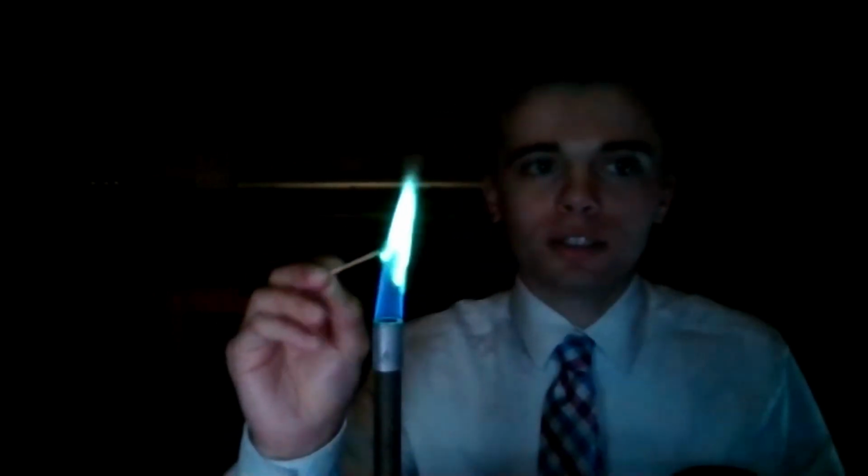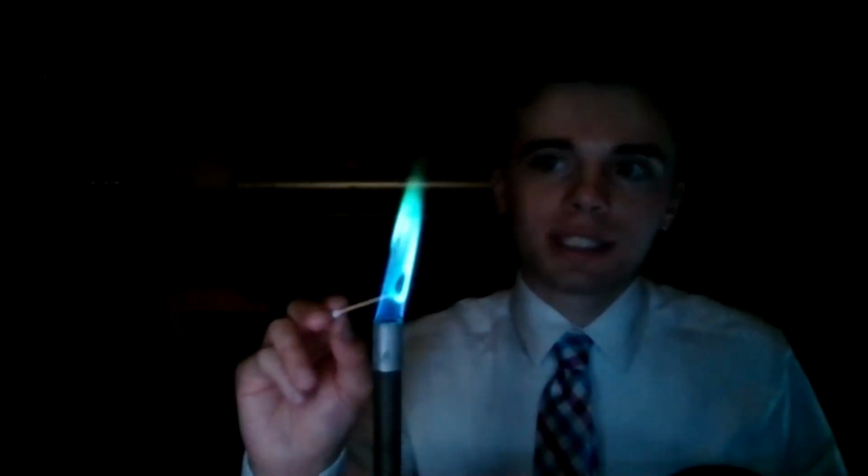No, isn't that cool? Copper's green. Luke, we'll do lithium next. Look at that, though. Normally, you would get to do this in person. You'd all be in groups and you get to do this. Maybe if we have time next semester, we all come back.